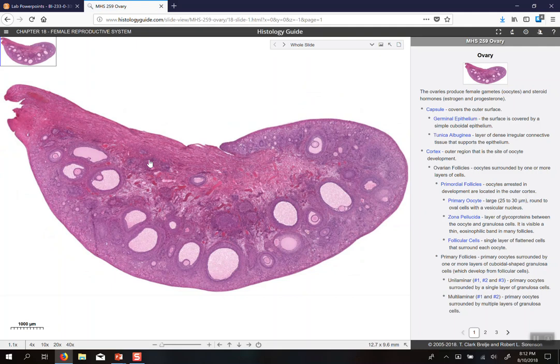So in humans, the ovaries take turns. One goes and then the other goes, ovulating month to month. In animals that give birth to litters, you have lots and lots of active follicles at the same time. So it's probable that this is an ovary of a litter-bearing creature. But let's zoom way in and look at some different follicles.